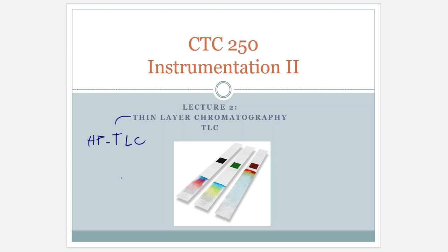But at the same time, we're also going to be talking about the HPTLC version. And the HP is not Hewlett Packard, folks. That's your printers. The HP is going to stand for high performance. So high performance liquid chromatography, that is a thing in a laboratory setting. But that is called HPLC. This is not HPLC. This is HPTLC. So high performance thin layer chromatography.